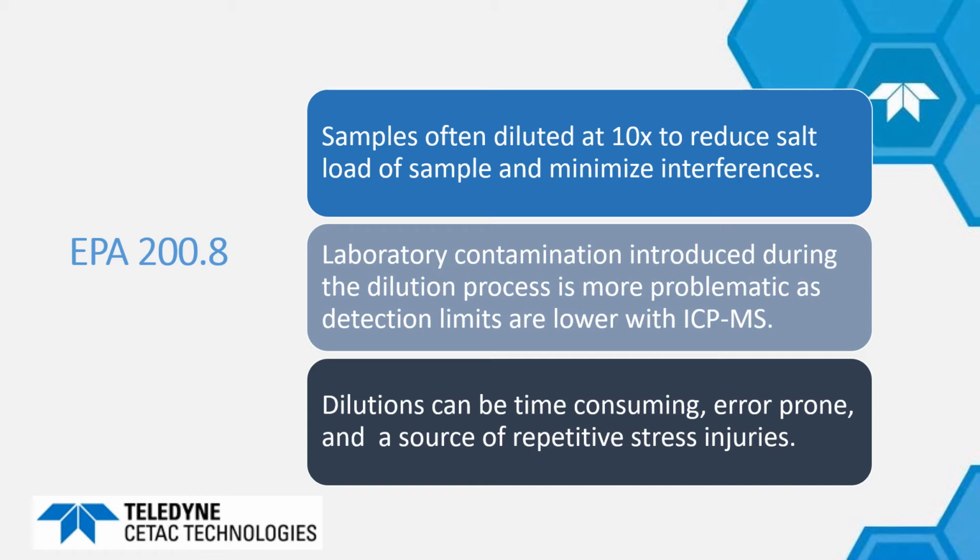So even if you did happen to make a mistake and type the wrong number into the software, you can go back later and see exactly what you told the hardware to do by reviewing your sample list in the software. That sort of traceability can be critical for laboratories, especially in a high throughput situation.